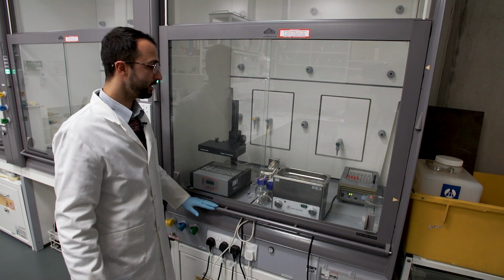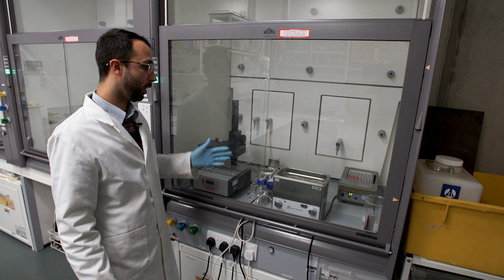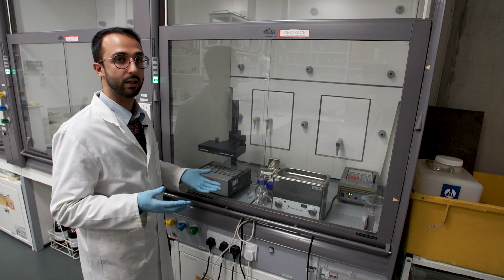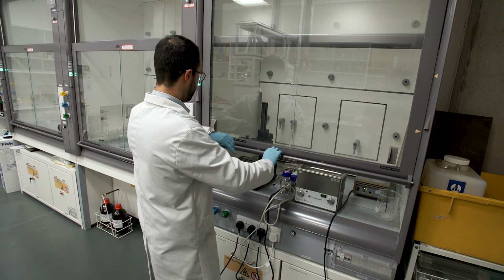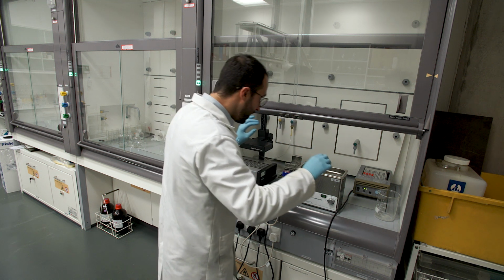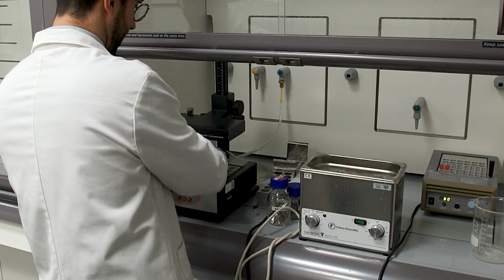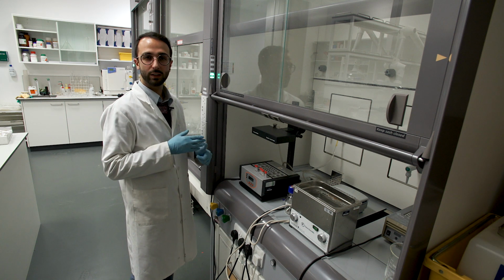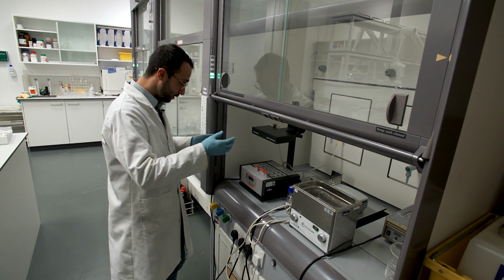Okay, so what I just did was to put the samples in that heating block. They are going to stay there at 80 degrees for 15 minutes because the heating is going to help the extraction reaction. Okay, so after 15 minutes we have to remove them, and the next step is to dry them under nitrogen because I want to get rid of the acid, I want to get rid of the acetone, I don't want them to be in my final solution.